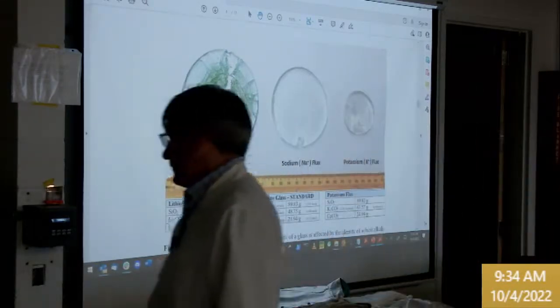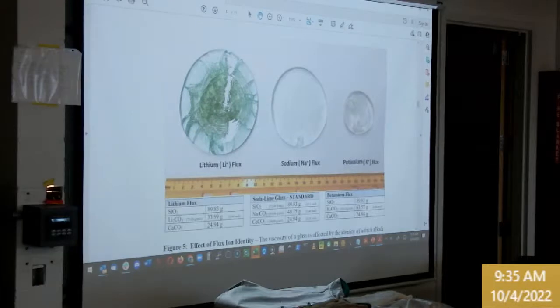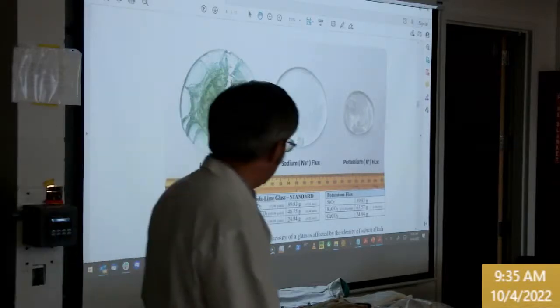So I've fluxed with lithium. If you look here at the top element of the furnace, you can see that it's cracked and caving in. Well, the ceramic in a furnace is also ceramics. It's silicates and alumina and zirconia. It's also susceptible to fluxes. So if you have fluxes that are able to vaporize, they actually embed in the brick, and because that one is bearing its own weight, it's not load bearing for the furnace, but it's bearing its own weight, it actually droops and sags. And so lithium, you gotta be careful. It's a fairly potent flux that can soften the brick in your furnace.